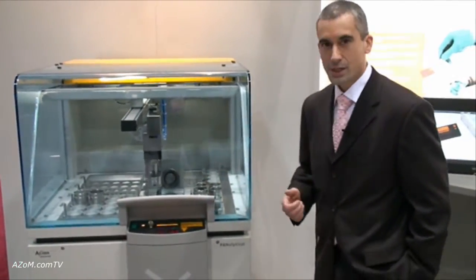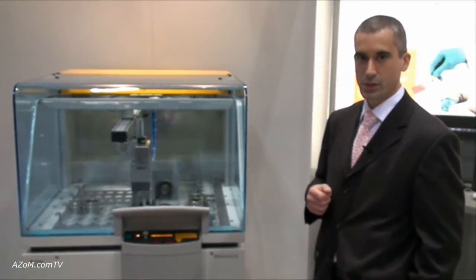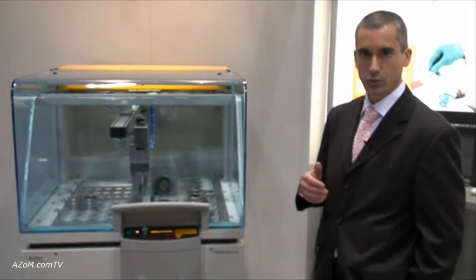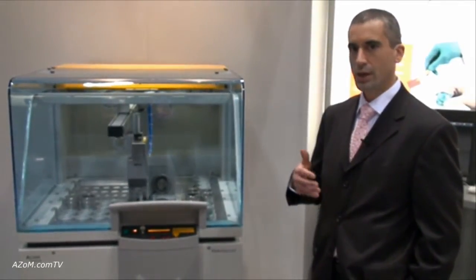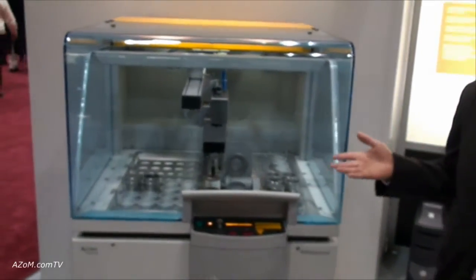This is our Axios Wavelength Dispersive X-ray Spectrometer that we're displaying here at PitCon this year. It's an instrument that's used primarily for industrial process control applications, cement applications, the steel industry, petroleum, and also research applications.